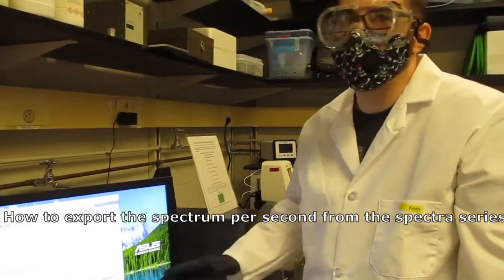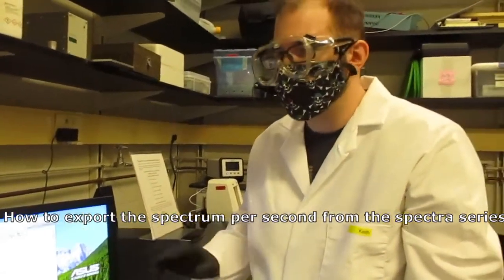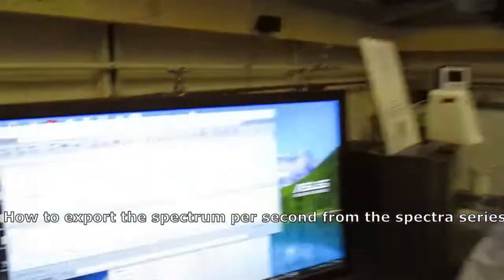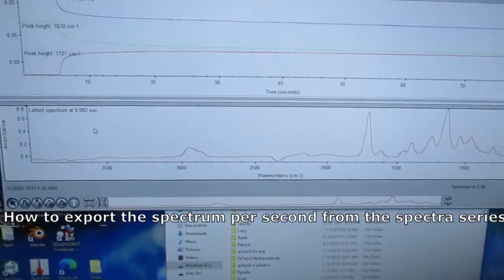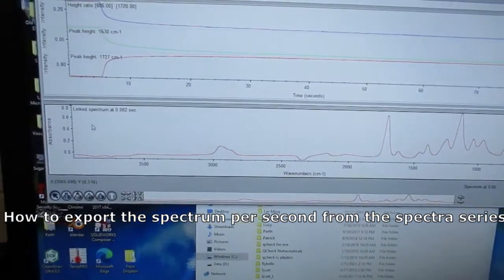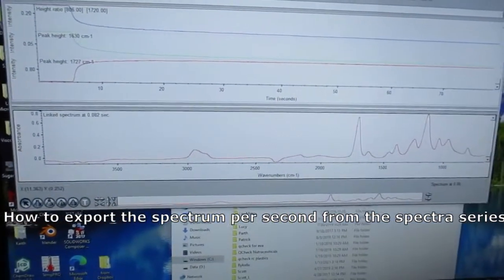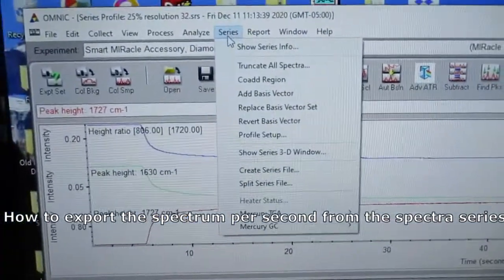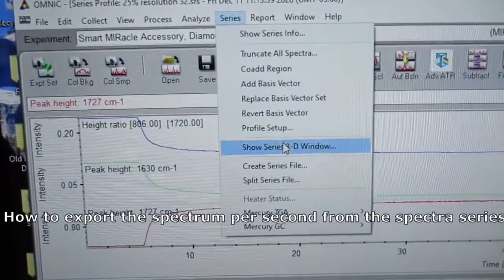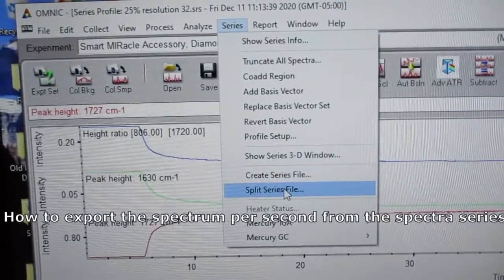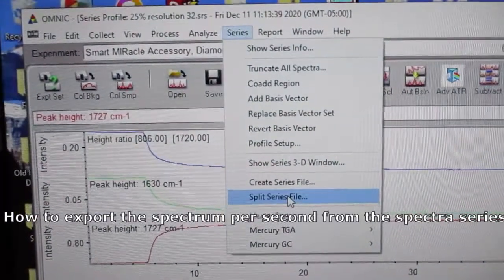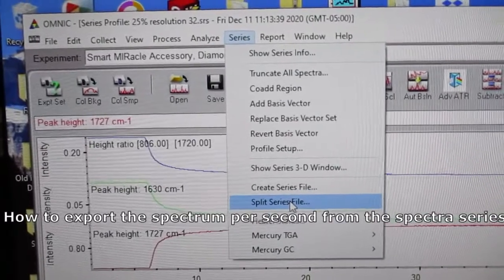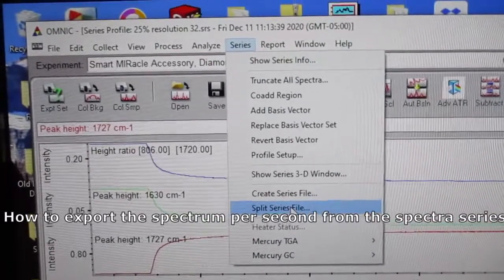Say you want every spectra that the instrument recorded in the software for a particular run. What you can do is have your run open, go to Series, and then go to Split Series. That'll actually create many files of each individual spectra it took.